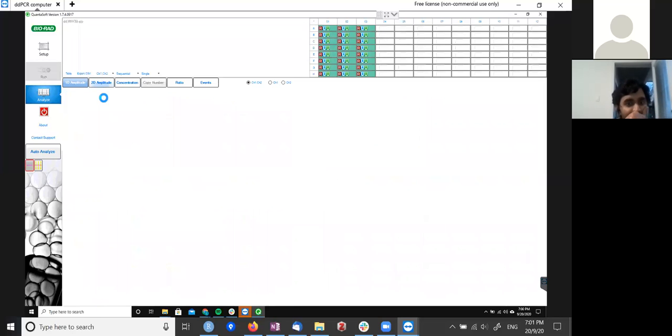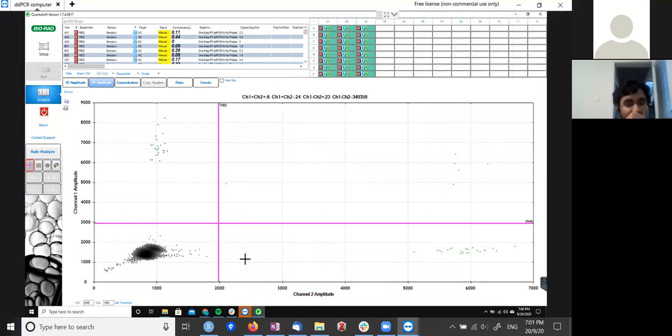So I have another question. When you set the threshold, for example if you set it at 3,000 because you have 2,000, 3,000, what if you put it at 3,000, 3,000? What difference would it make? Okay, let's see this point and try to figure out where it belongs. Oh, okay, I see now. So only for that one particular sample, it will make a difference. Oh, I see. Okay, so it seems like it is G1. So we'll just scroll over to G1.